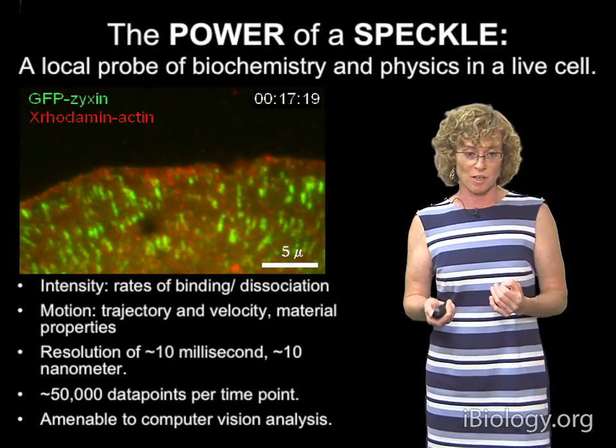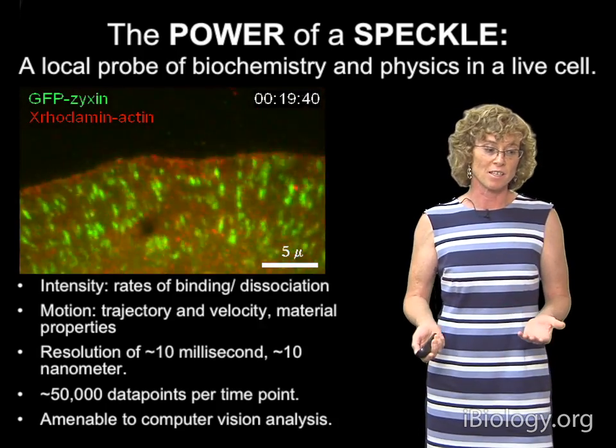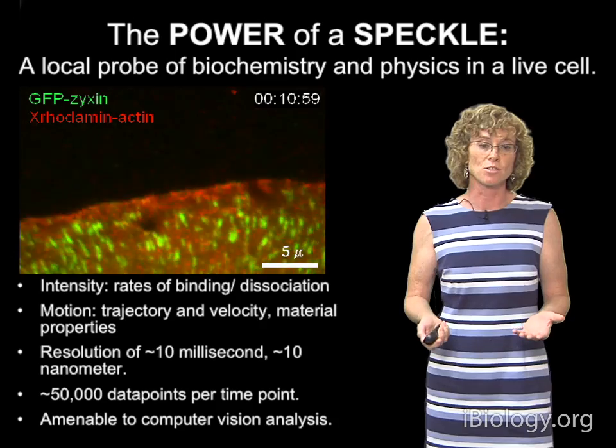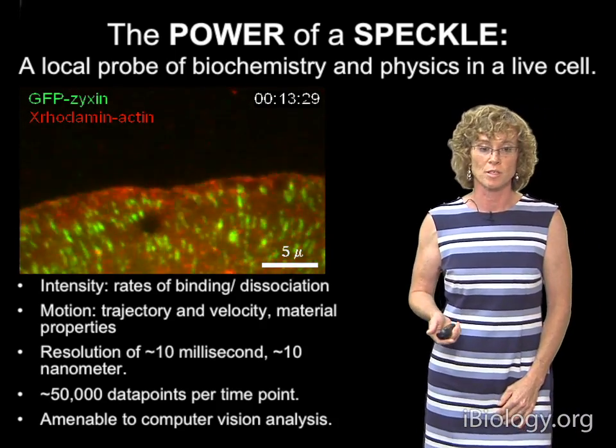What you need to do with all of this data is extract it in an efficient way, and to do that, you need computer vision analysis tools.